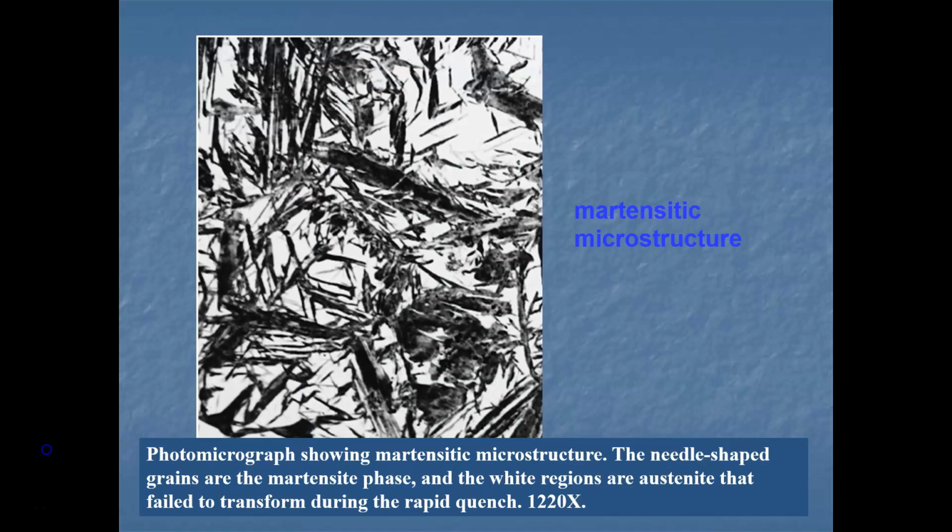It is a martensitic microstructure. And remember, martensite has needle-shaped grains. And this has been viewed under a microscope at 1220 magnification.